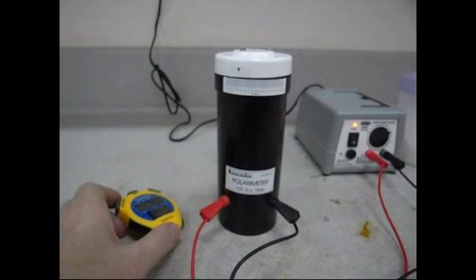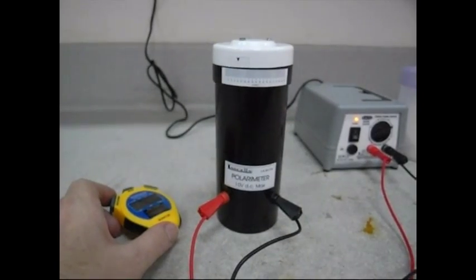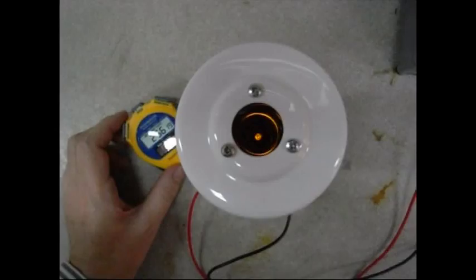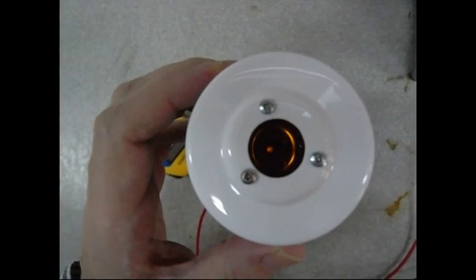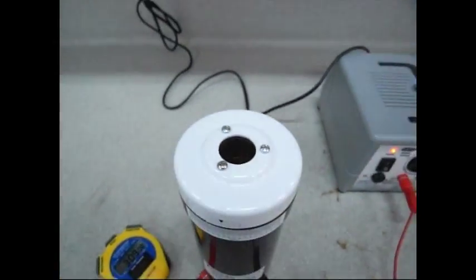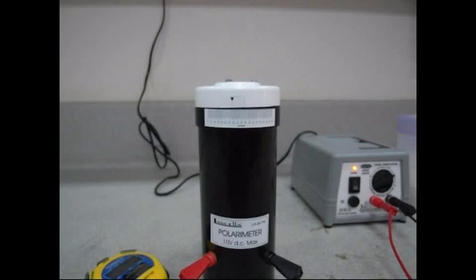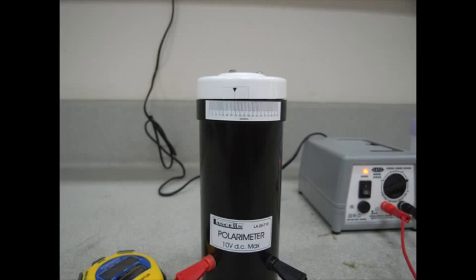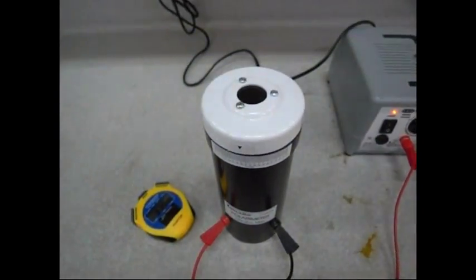We're just coming up to three minutes. We can confirm that the initial reading was taken and the polarimeter was moved 20 degrees in a clockwise direction. If we take a reading at three minutes, we rotate the second polarizing filter until the light goes out, and we now find it's at about 34 degrees. So 34 at three minutes.